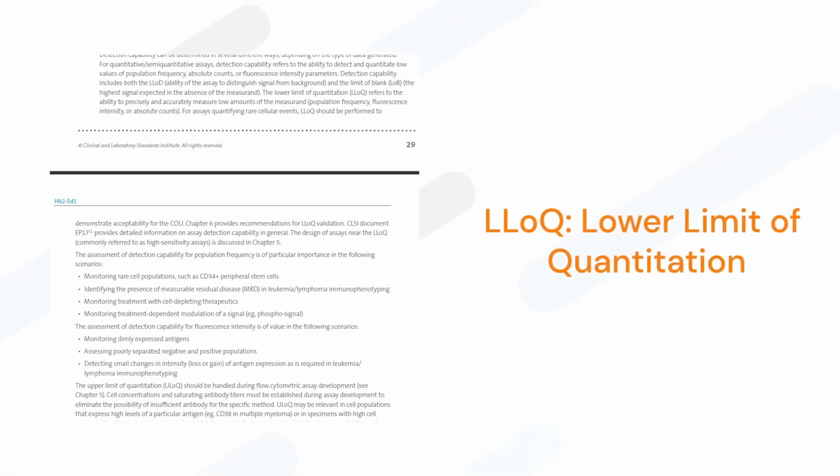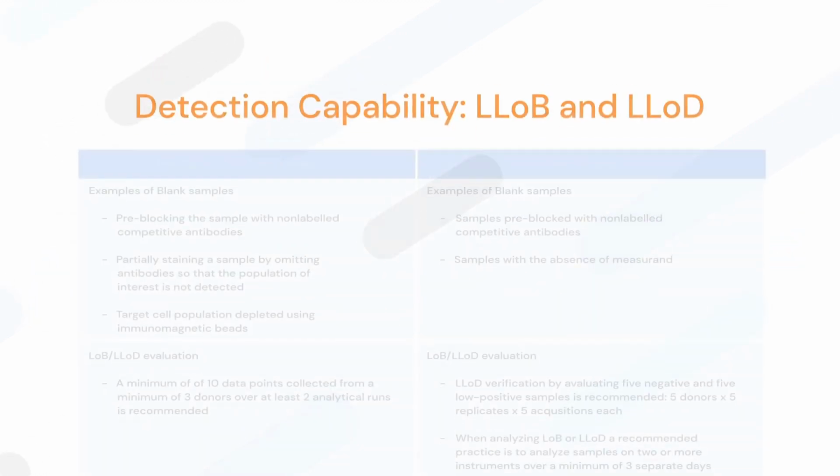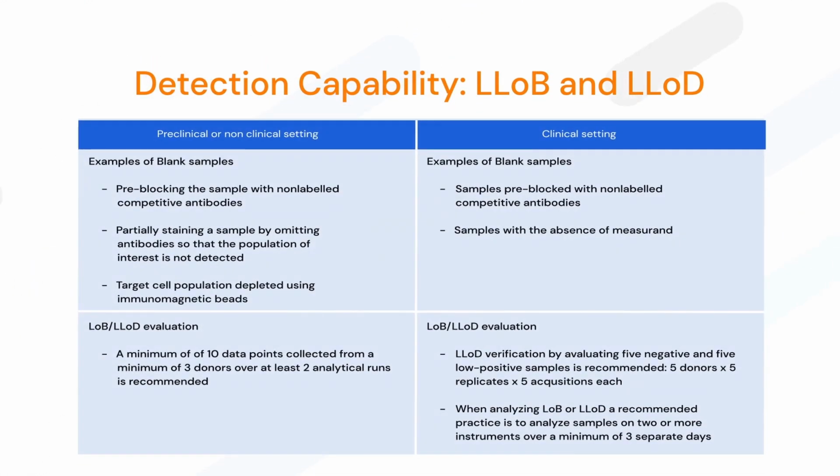LLOQ refers to the ability to precisely and accurately measure low amounts of measurand. Detection capability assessment is important in various scenarios. Depending on an assay's intended use and regulatory status, different approaches can be employed for detection capability evaluation.